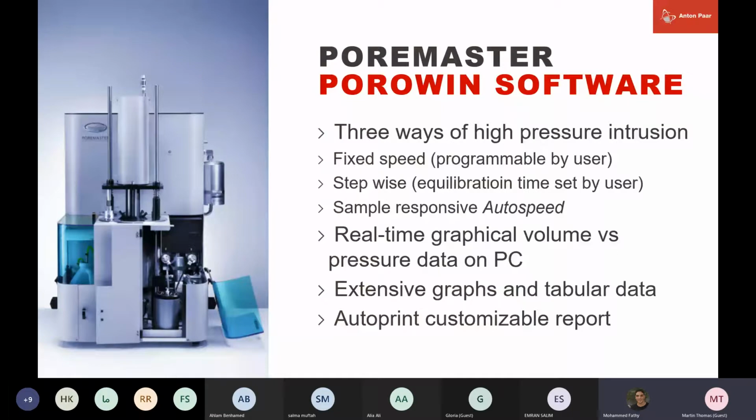So basically the pressure generator goes slowly at a constant rate, constant motor speed. We don't use a pressure intensifier. We just use a geared down motor to force a piston into an oil cylinder and transfer pressure that way. So it's not an oil pump or intensifier. It is a single stroke cylinder that's driven by a motor.